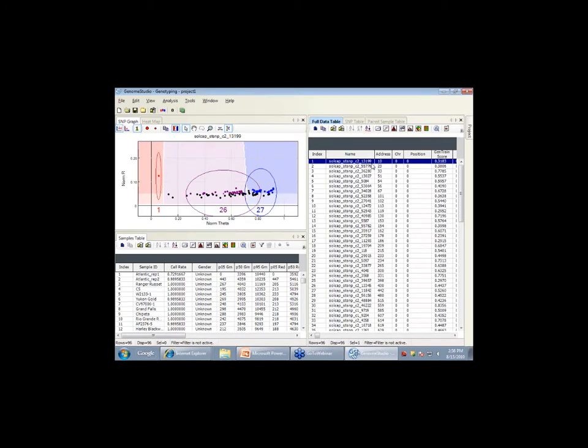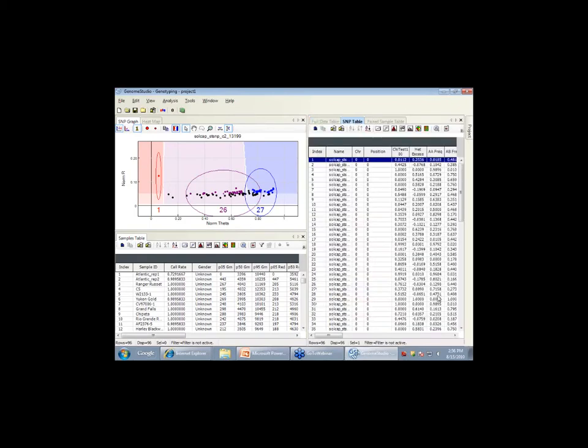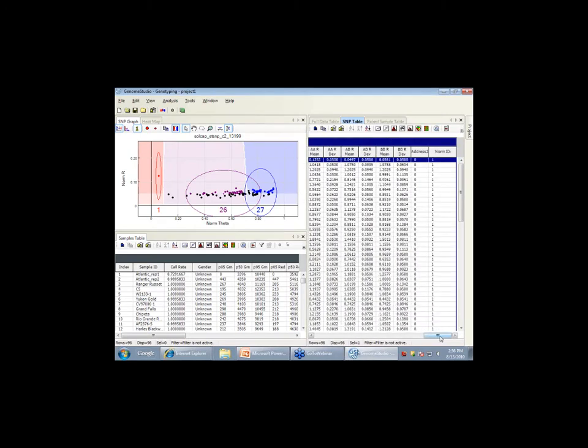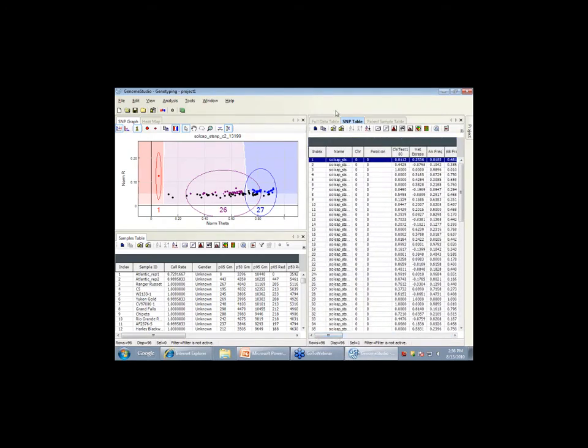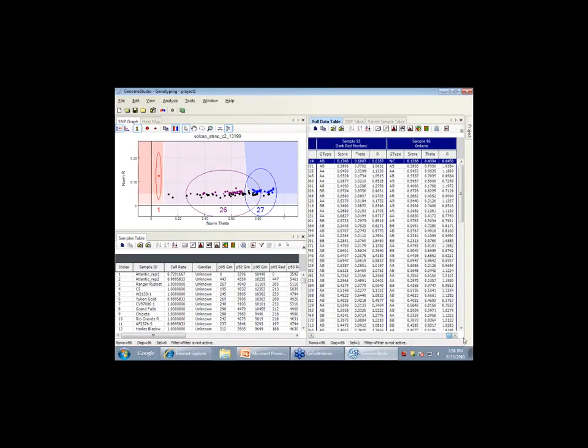It will provide the location of the SNP and what the two alleles are. And as soon as the public genome sequence is completely available, we'll be able to put that right on the genome browser, showing what the polymorphism is. Right now we can't, but you could take that contig and you could BLAST it, and you could easily find out.